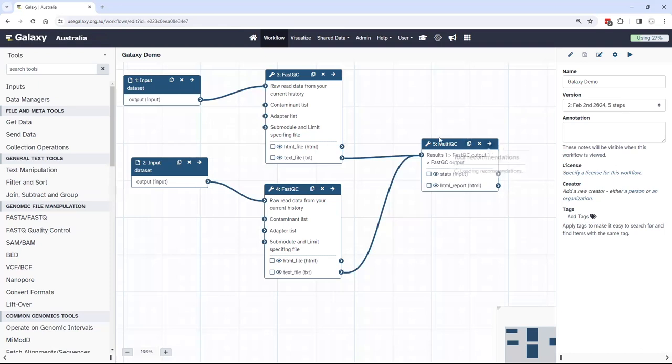So I as a user only have to review the results once in MultiQC as an aggregate of all my many FastQC results.